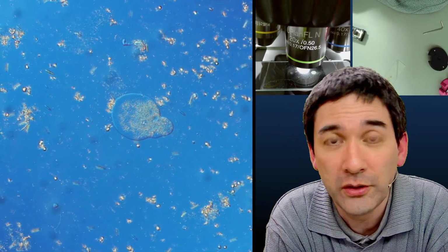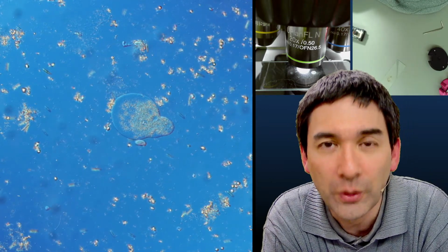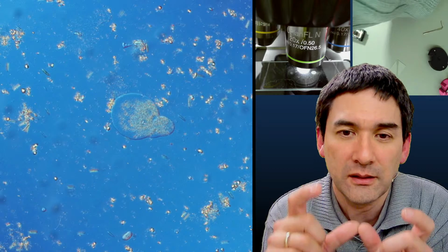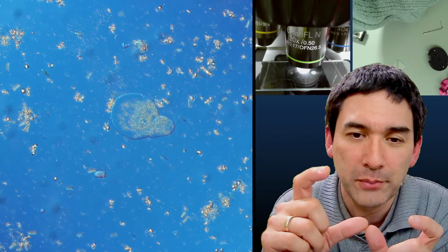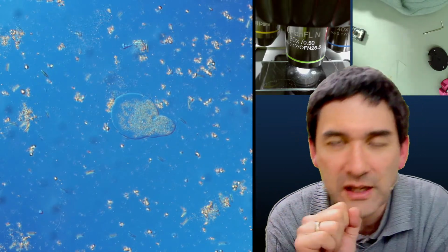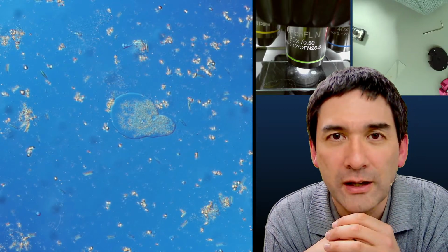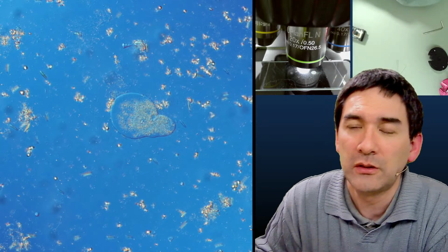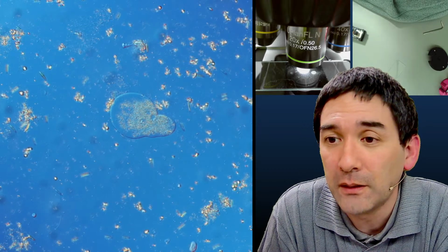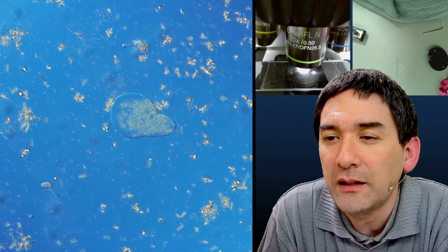So yeah, I'm going to go out quickly, hopefully there's still some Easter egg colors available, but the red one is quite interesting because it contains carmine. They sell them at least in little plastic or paper bags with some powder, and I checked the ingredients, and there was actually carmine in the red one for Easter egg colors, and that's an easy and cheap source of getting the stain, because normally you'd have to get it from a chemical supplies company, and then it's expensive, right? So PCR and gel electrophoresis machine, I heard, is good for genetic identification.